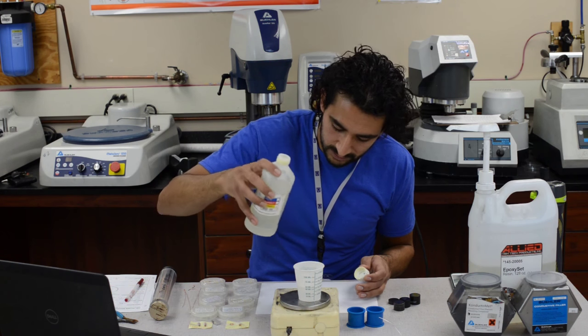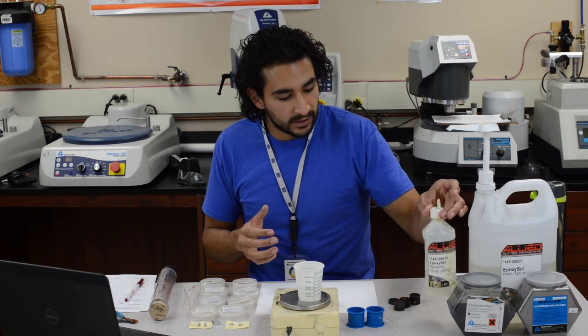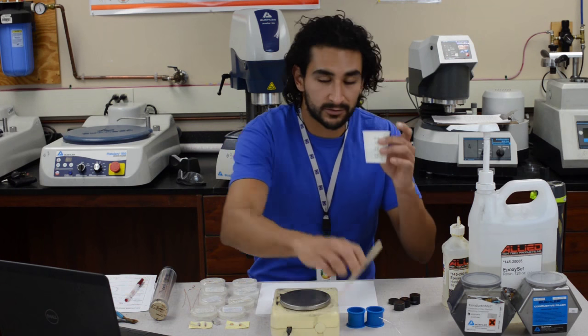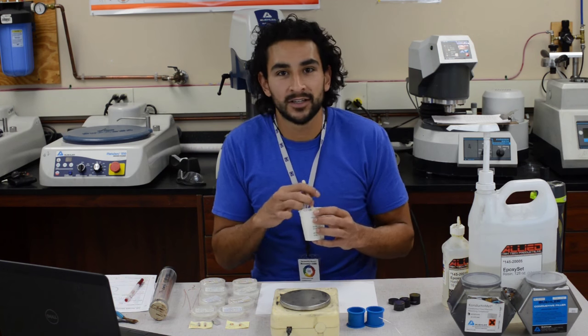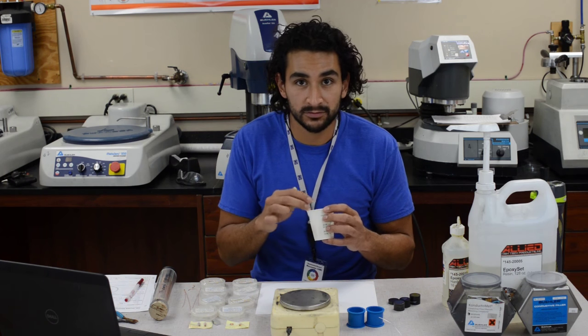6.2 — went over a little bit, not too bad. There you go — you have your epoxy mix. You mix this for about three minutes, and that's what I'm about to do.